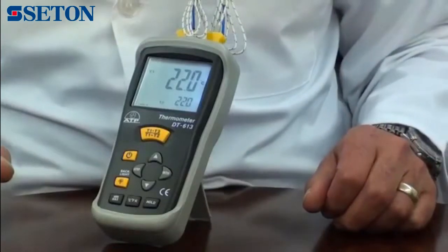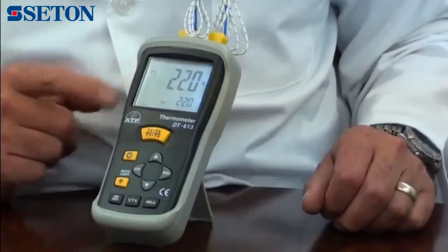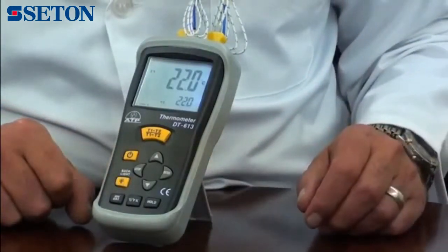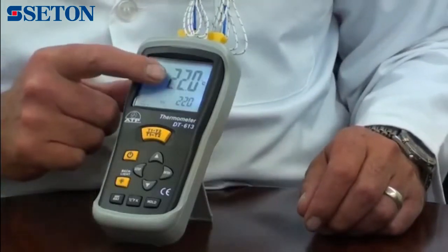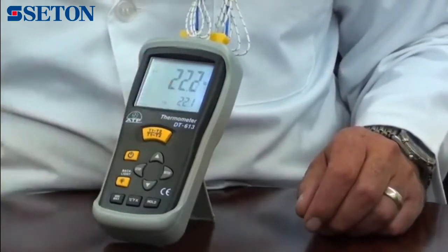The display is a large 45mm high-contrast LCD, with a backlight for work in low-light environments. It will display thermocouple 1 as a primary measurement, with thermocouple 2 measurement as a secondary.